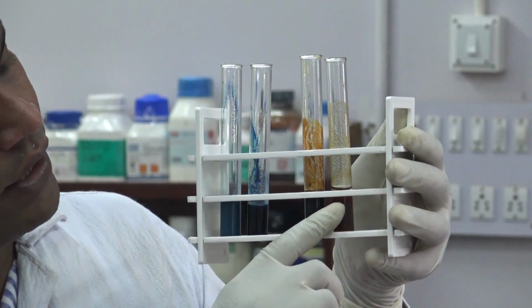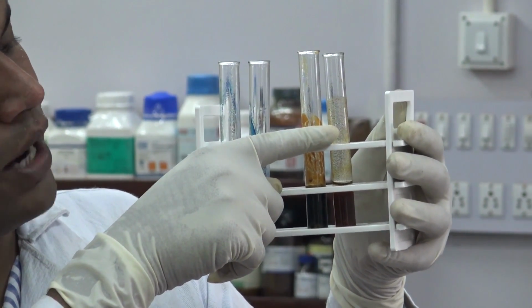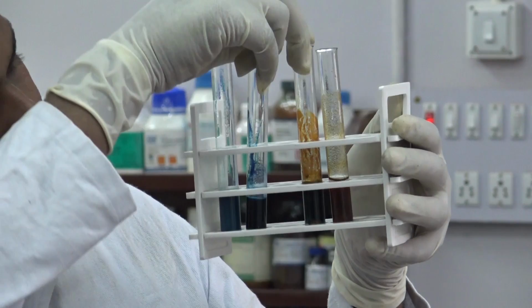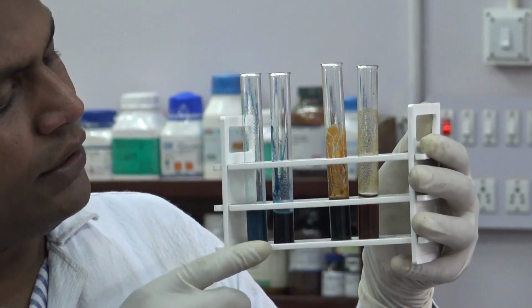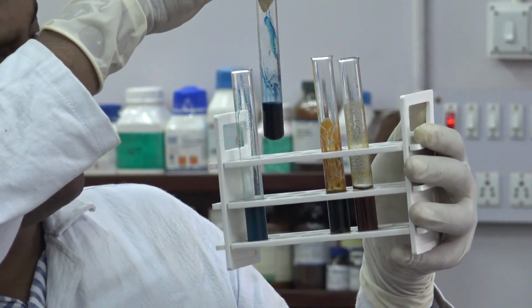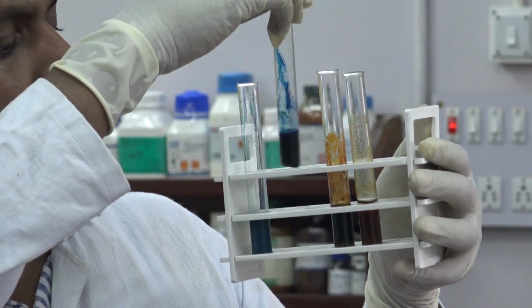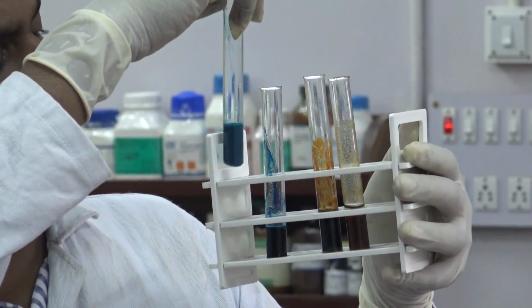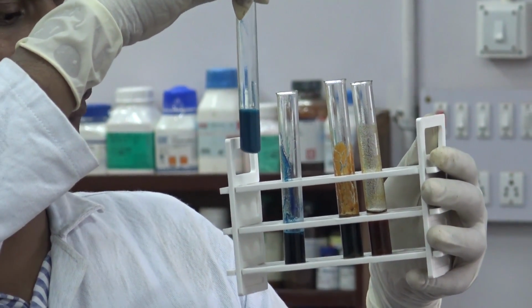First of all is the ammonium hydroxide test, by which ferric ion gives brown precipitate and ferrous ion gives dirty green precipitate. By using potassium ferrocyanide test, ferric ion gives dark green or dark blue precipitate, but in case of ferrous ion we will get this type of blue or bluish green precipitate.